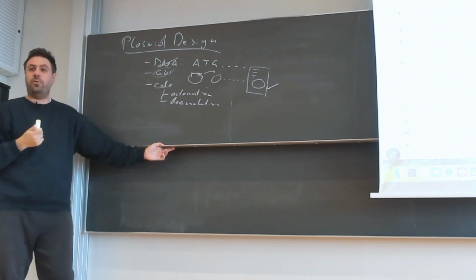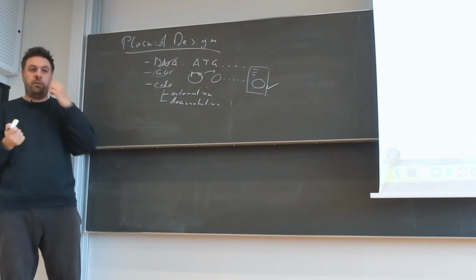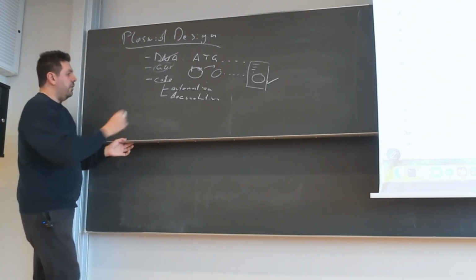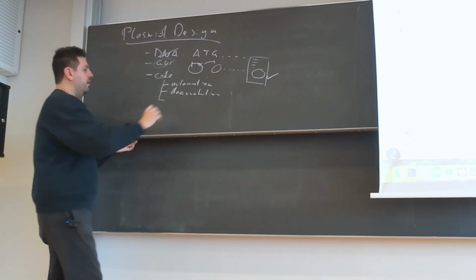This is much more error prone, and code is a really great tool to precisely describe what you want to be done. Code is marvelous for this. And very related to it, perhaps even the same point, is verification.